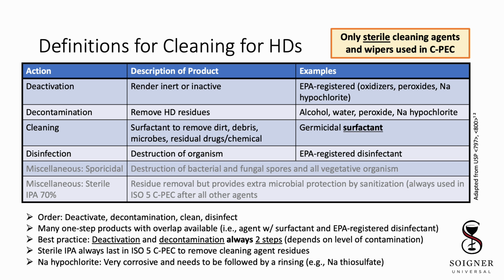Deactivation is the rendering of a drug or a chemical inert or inactive, often by using a product that's an oxidizer, a peroxide, or sodium hypochlorite. Not all chemicals have a known deactivation, or if you are a high-volume hazardous drug compounder, it may not even be feasible to carry every deactivation product needed. Therefore, if deactivation is not possible, the goal is to focus on decontamination.